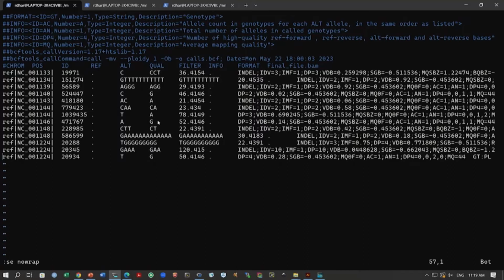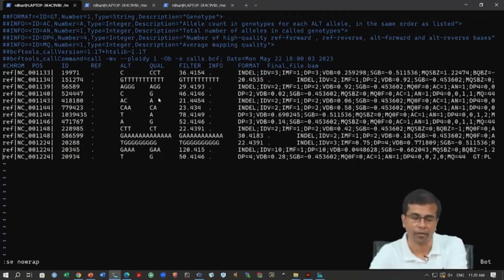You have all these interesting variants around here, and there are a lot of indels, and then there are some SNVs. You can see these SNVs here, T2A or A2G, and again their positions and the chromosome are given. Okay. So, what we will do, we will now go to integrated genome browser, and we will open up this alignment, and we will see whether we can actually see this variant, and whether it is an artifact of alignment or not. All right.